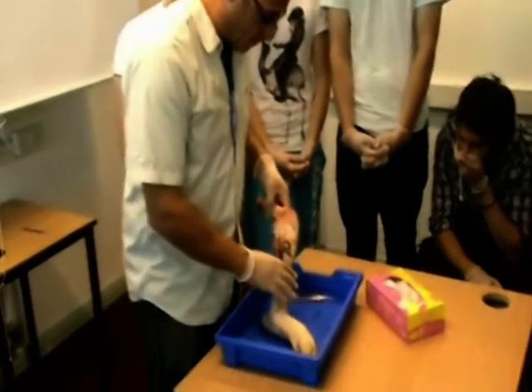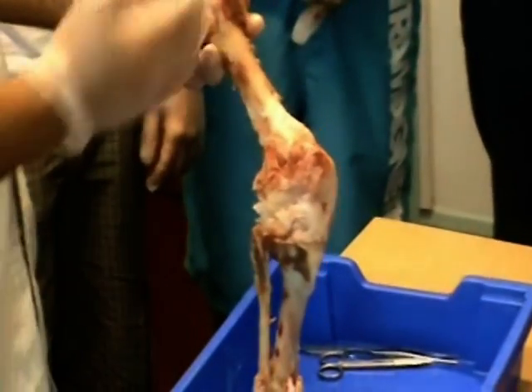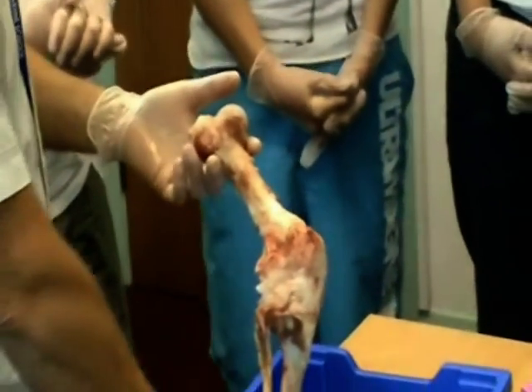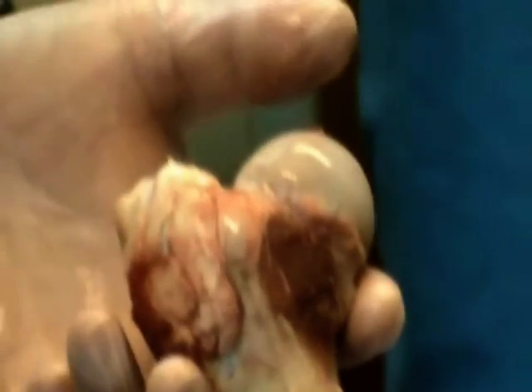Right, okay then, guys. So, on first inspection, then, what can we see? You're holding the ball in front. Okay, yeah, this joint here. Yep. Okay, so yeah, hip joint, ball and socket, synovial joint. So, what are we looking at here then? What's this substance in the end? That's synovial fluid, isn't it? No. No? That's cartilage. No, okay.